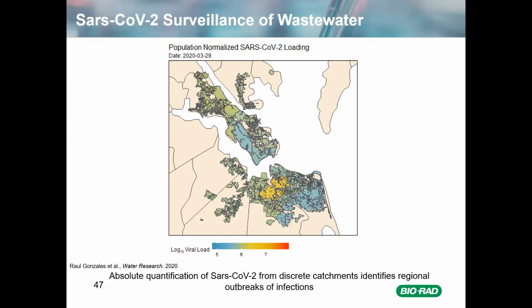One thing I do want to point out, which is very cool, at least to me, is if you keep an eye right on this little area right down here, in July, you're going to see a very prominent spike in the viral load in wastewater. So it's coming up here in just a second. So you see this very prominent spike that then decreases. This was actually associated with a cluster of positive cases on a naval base, and they were able to see that even in the wastewater. So I think a very cool approach.